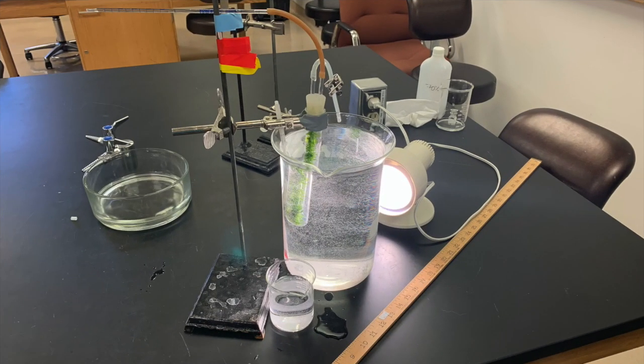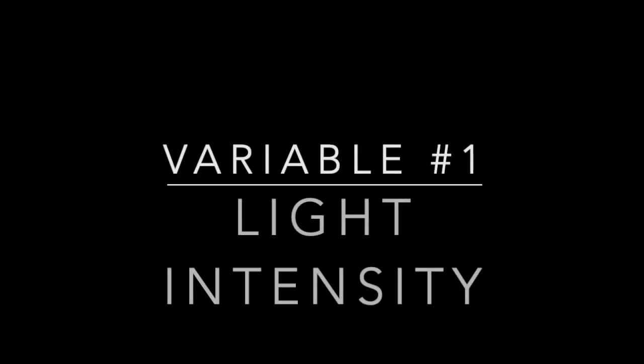So to begin our experiment, we've let our beaker sit for a little bit so that the water is room temperature at around 20 or 21 degrees Celsius. And we have also turned on this desk light, which is serving as our light source, and it's positioned about 30 centimeters from our apparatus. We're starting off with a control run of the experiment, and we will be measuring the position of the air bubble in the pipette every minute for 20 minutes, and then we will calculate the rate of gas produced per minute.